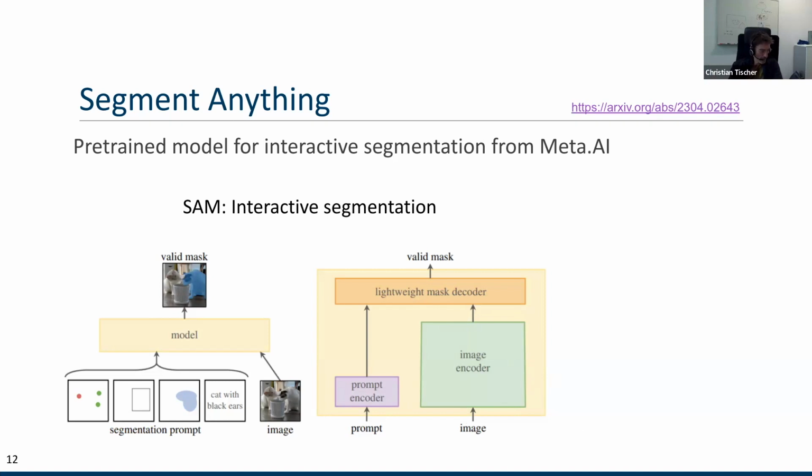Maybe again, fluorescent 3D nuclei, fully automatic. Did you try this? Yes, and it works decently. It depends on how big the nuclei are. If they're very small, it's a bit tricky. If they're big enough, it works quite well.